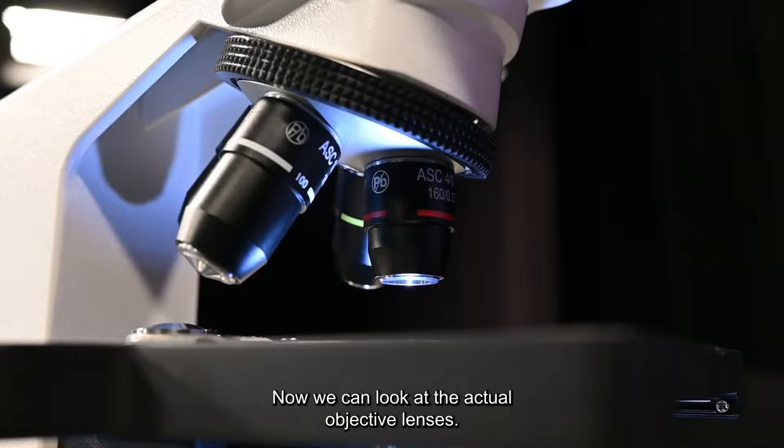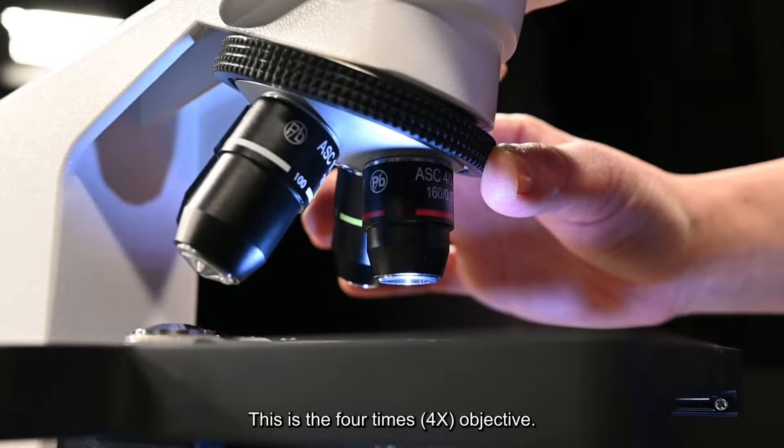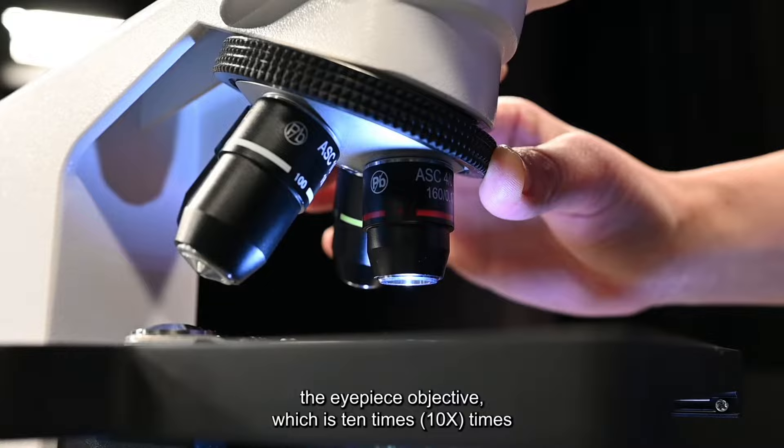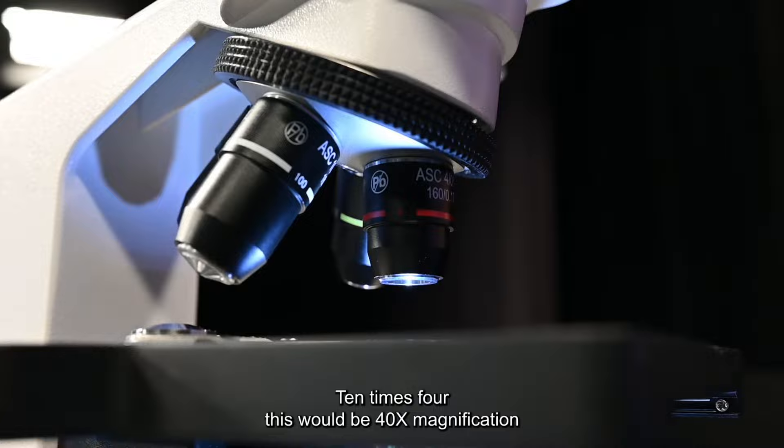Now we can look at the actual objective lenses. The one that I have right here is the shortest one. This is the four times objective. When we're looking at total magnification we're going to take the eyepiece objective which is ten times, times this right here, ten times four. This would be forty times magnification.